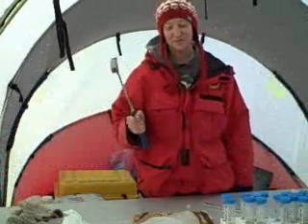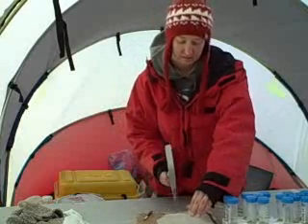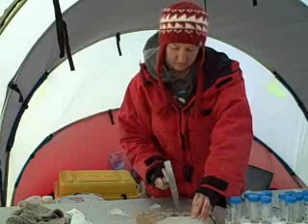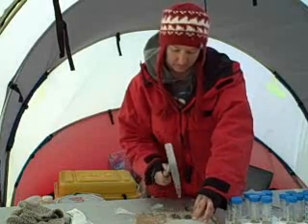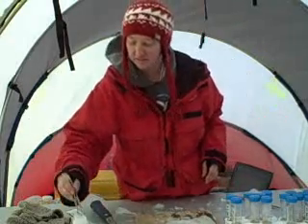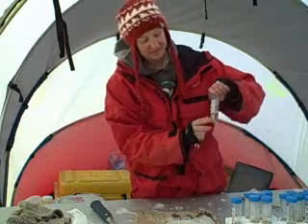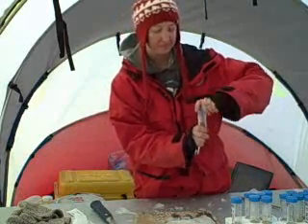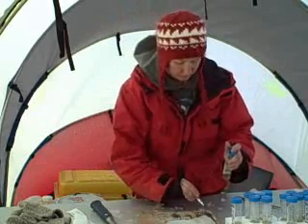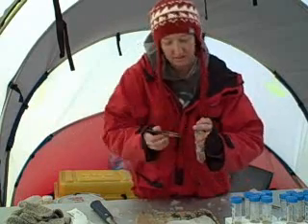Our next set of tubes is going to be clean ice. So let's chip away some clean ice. Alright, we got some good chunks of clean ice there. So take our forceps and dip them into our ethanol again. We'll take the one that says clean ice cold, and we'll put a chunk of clean ice in there.